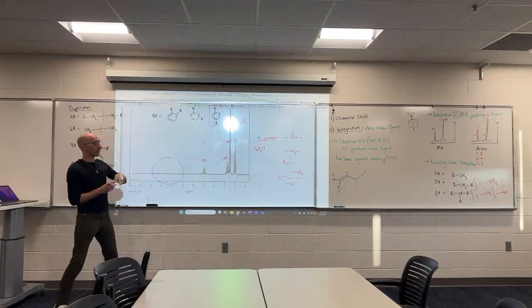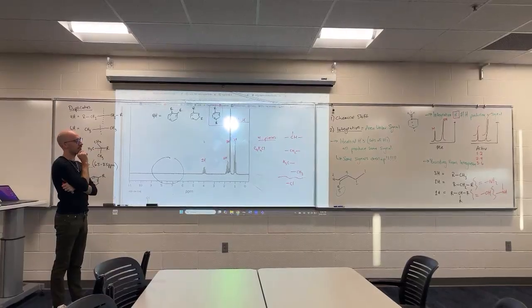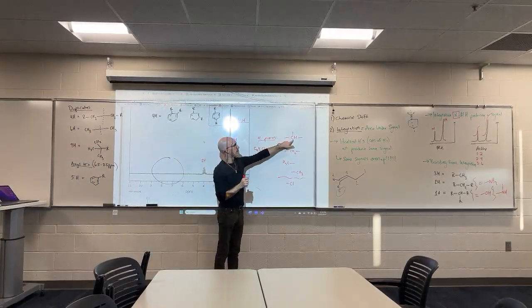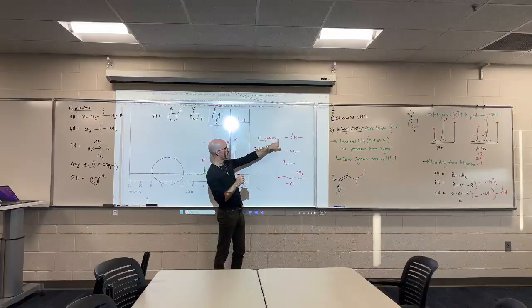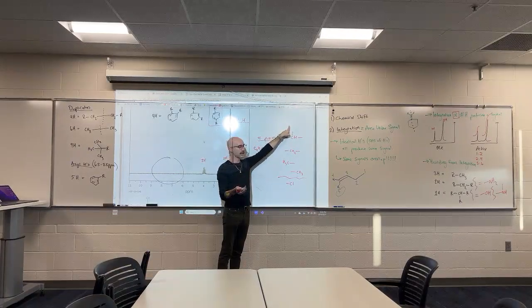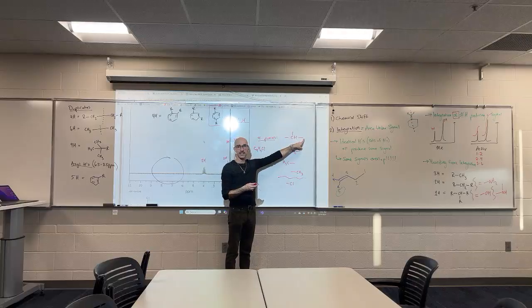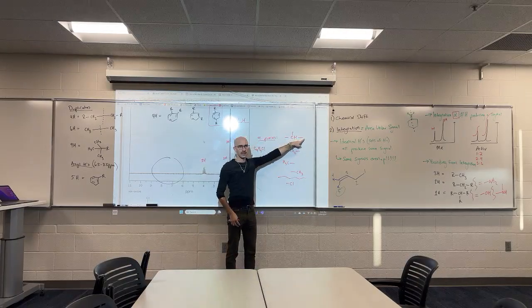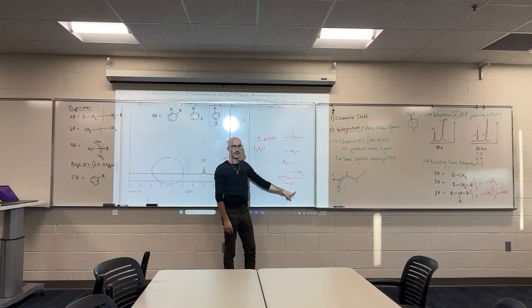So there are several different ways that I can piece together these 5 pieces. For instance, what if I have CH3 connected here and CH3 connected here? That leaves CH2 connected here. But CH2 needs 2 connections. So the last connection would be out to the chlorine.